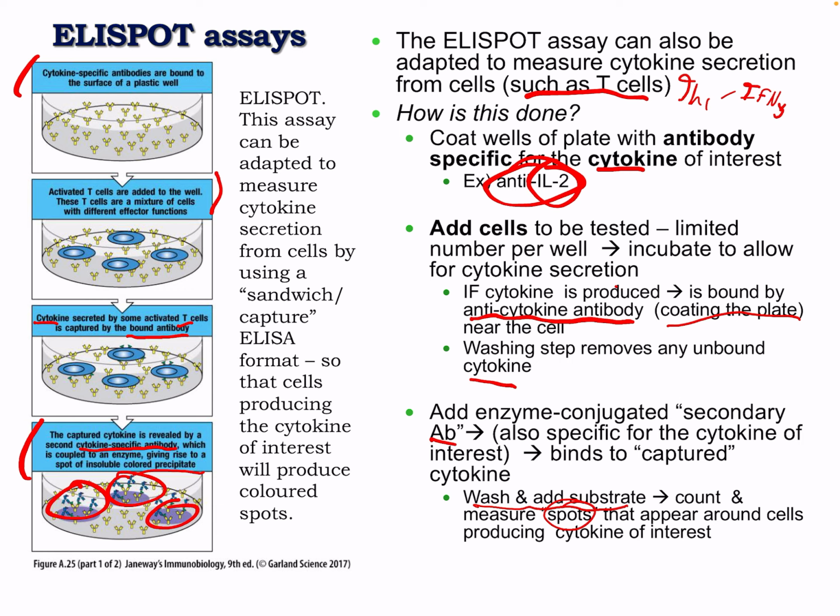So yeah, those are ELISAs. These are really commonly used in many studies, and a lot of the work I've done or will be doing in my research is looking at saliva or blood and cytokines, and this is used in a lot of exercise immunology, different stuff like that. But again, super relevant, and if you haven't had a chance to go into the lab and try this stuff, this is kind of a decent theory background, but there's also a lot of good YouTube videos out there if you want to see the actual procedures done in person, and I recommend searching for it.